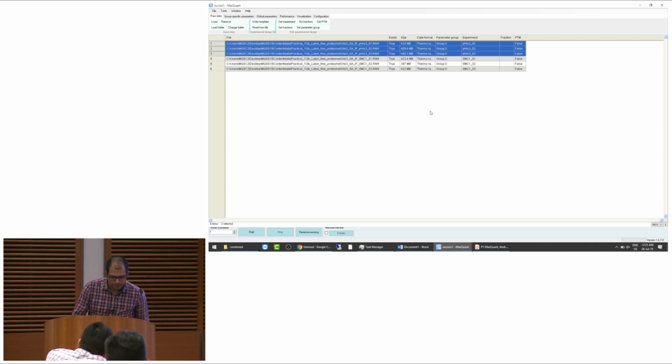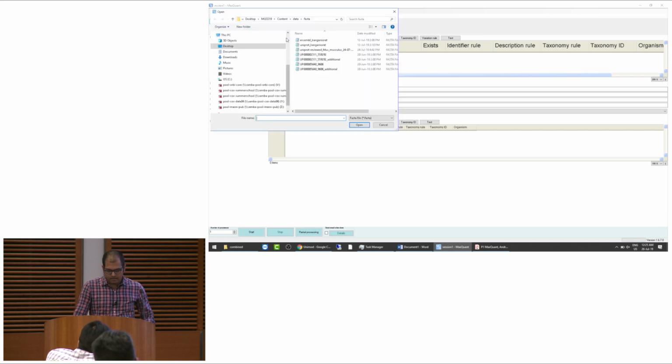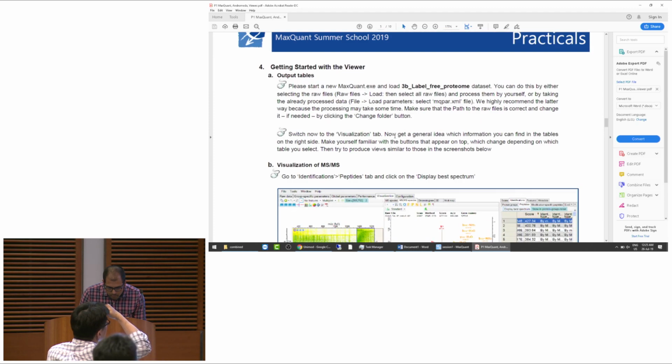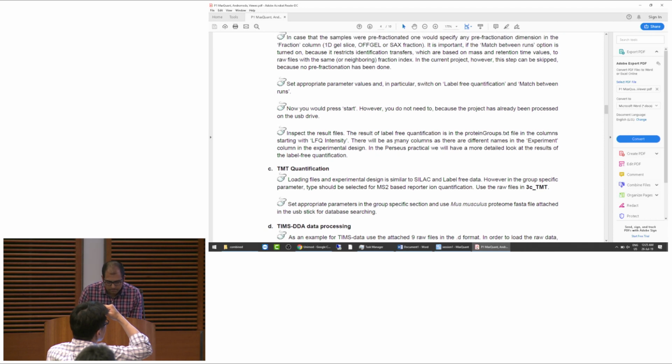Okay, so here it's the same, so we just have to add the database. Human? Okay, good.